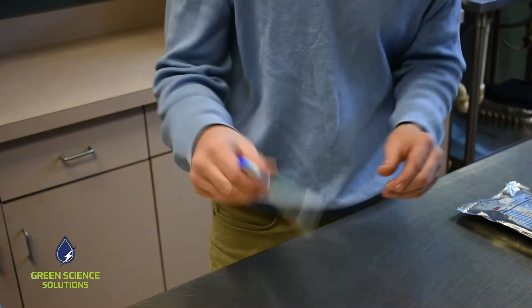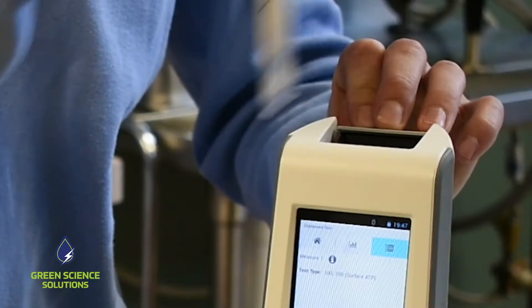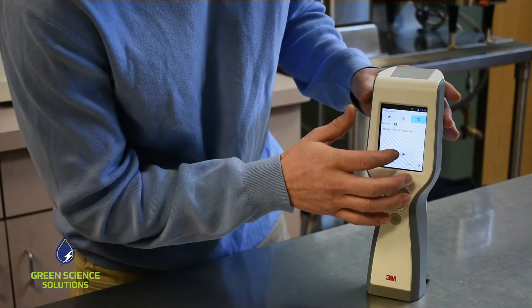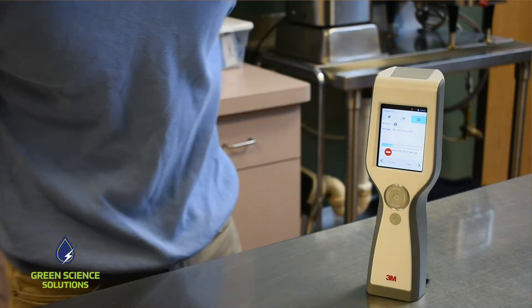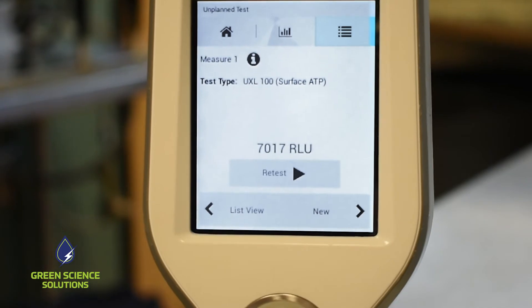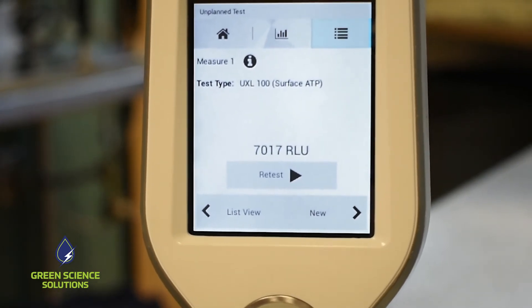Snap the swab into the solution, shake it up, then put the swab into the LM1, and in just seconds it gives you a reading as to how clean or dirty the area is. See that number? That score tells you how much dirt or ATP is on the surface.